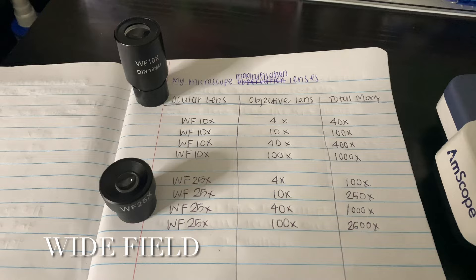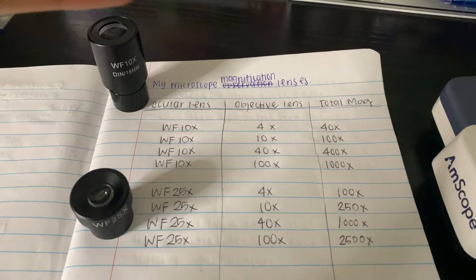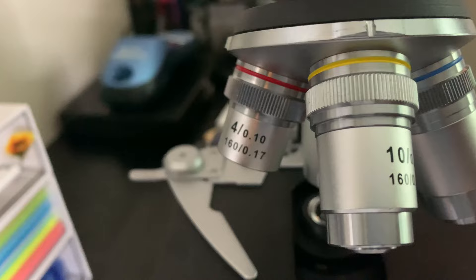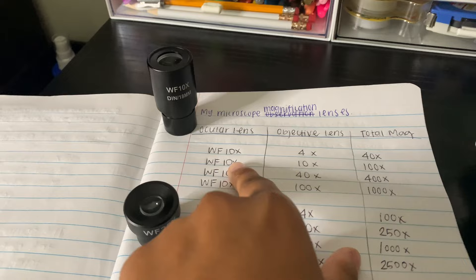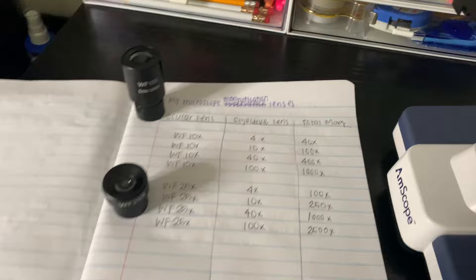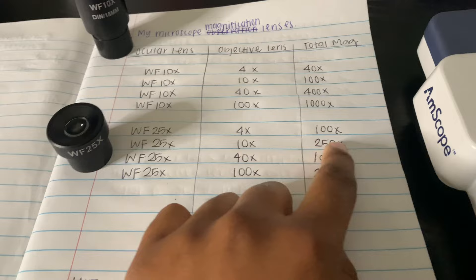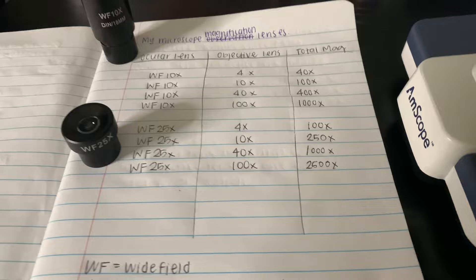Now let's go over total magnification. With the wide field 10x ocular lens, the ocular lens is multiplied by the objective lens to give you total magnification. So on 4x: 10 × 4 = 40x. Then 10 × 10 = 100x, 10 × 40 = 400x. The same applies to the wide field 25x: 25 × 4 = 100, 25 × 10 = 250, 25 × 40 = 1000, and 25 × 100 = 2500. It's simply multiplication.